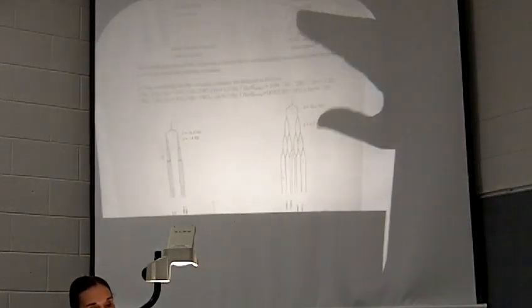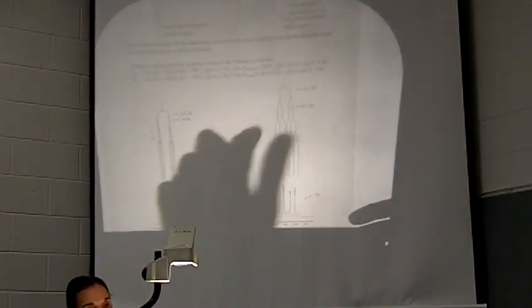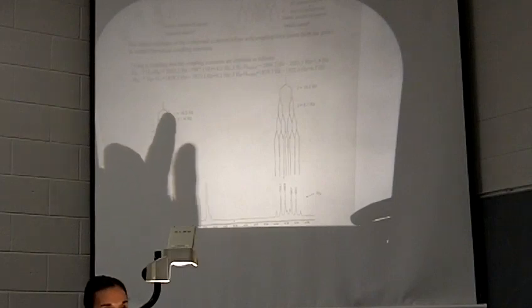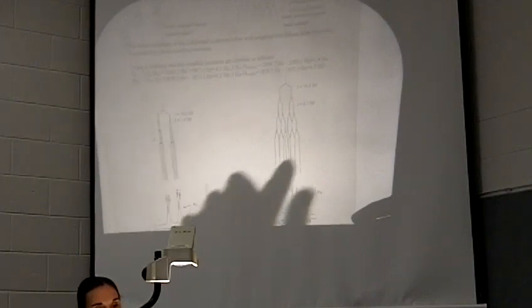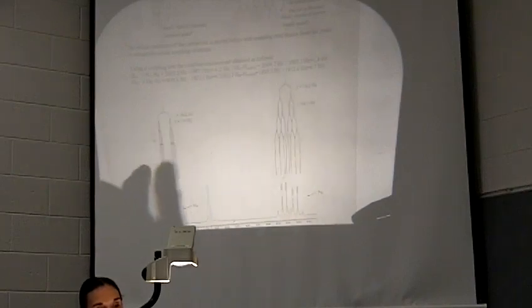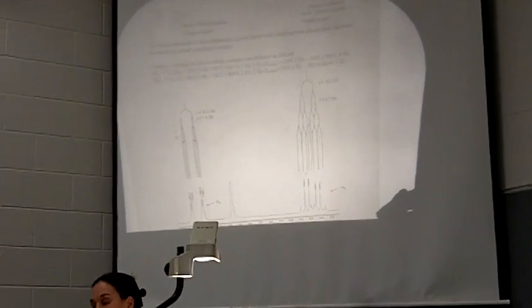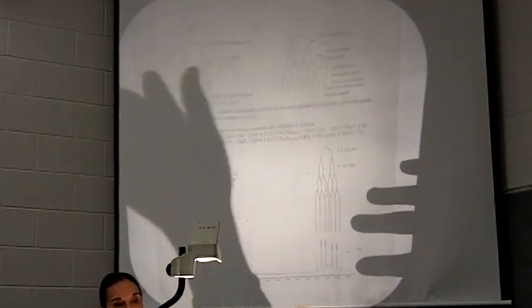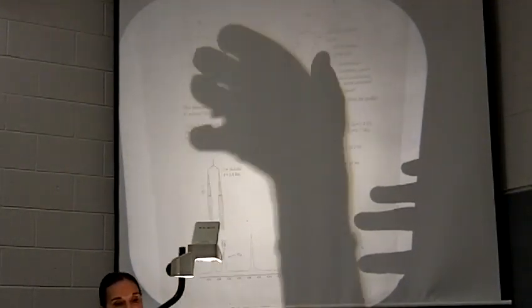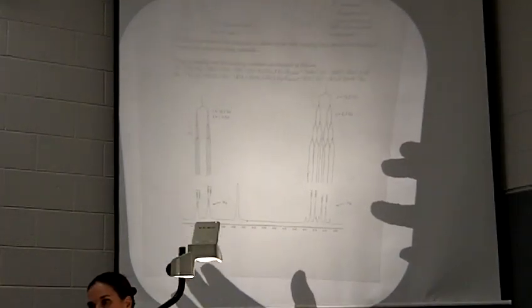The other part that they show you in the lab manual is the actual proton NMR. You can see that interaction. That is what you are seeing in the peaks that are shown. And this is how you would draw the splitting trees above those signals. That's what you will eventually need to be able to do with experiment 17: draw your prediction of the splitting and tease out the splitting from what you see in the actual spectrum.